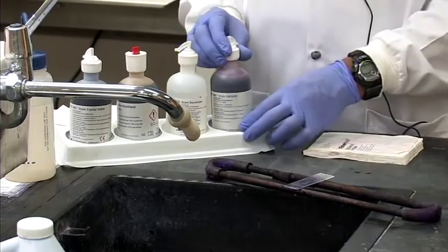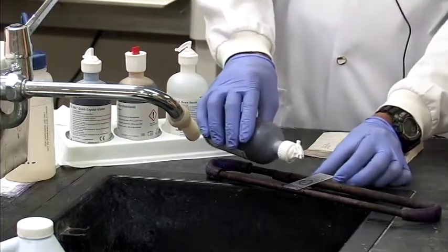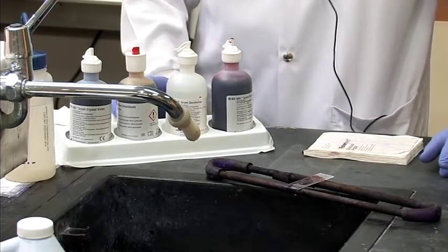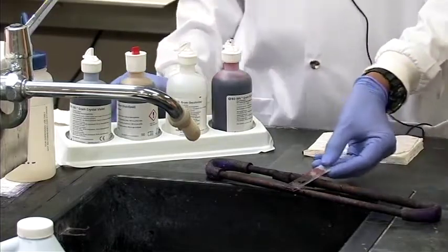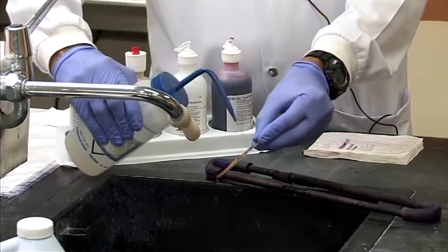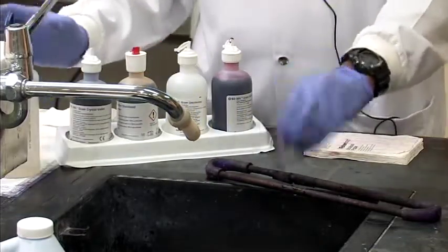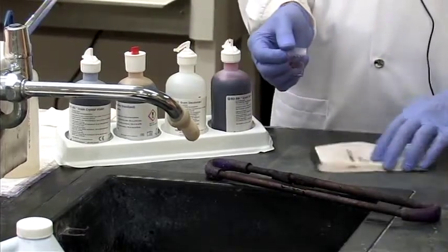We go on to the final stage now, which is our counterstain, safranin. So again, we're going to apply a few drops. Let it react for 30 seconds, and then we'll wash off and dry. So assuming 30 seconds has elapsed, shake out again the extra stain, wash around the smear. Sometimes you can wash the back of the slide too to get a nice clean slide, and shake off the excess. So now we have the gram stain finished here.